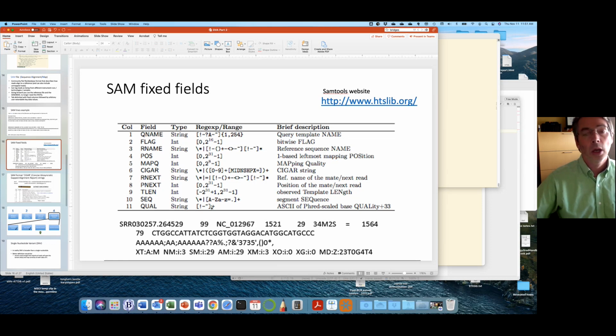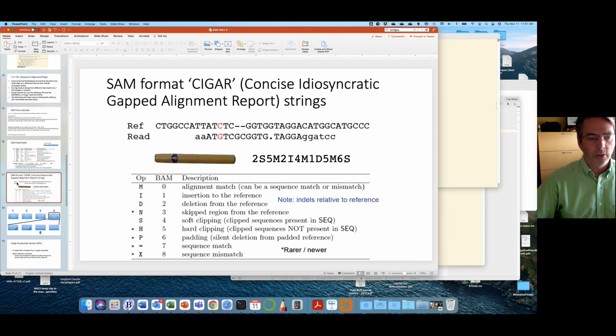The software is going to do that for you, but especially if you're trying to write new software to do some kind of genome analysis, it's not something you're ever going to commit to memory. You're going to have to go and reference the format in order to know which lines and how to pull that information out. But I mentioned CIGAR format, so this was one of the cool breakthroughs in developing SAM as a compressed representation of how reads map to a genome.